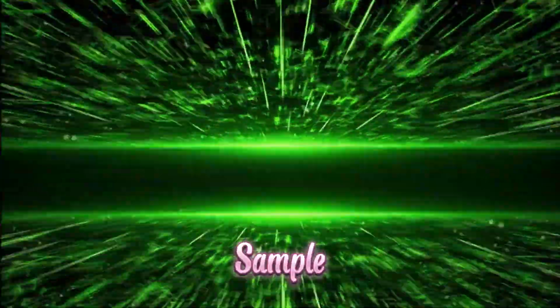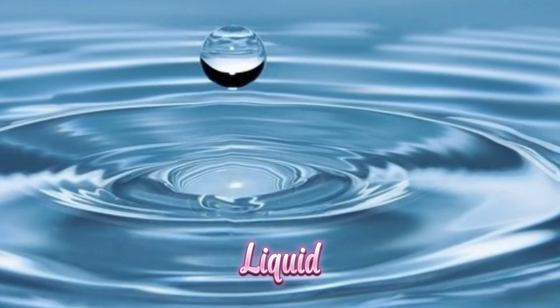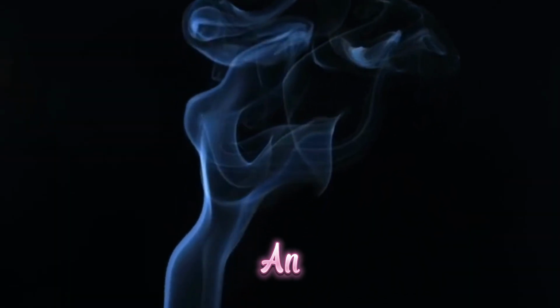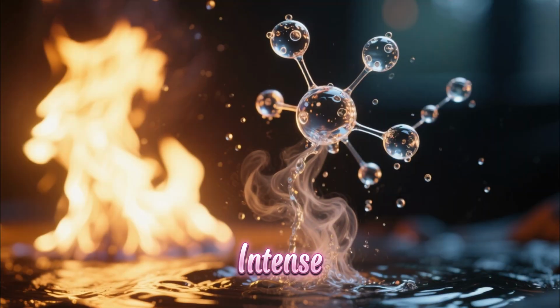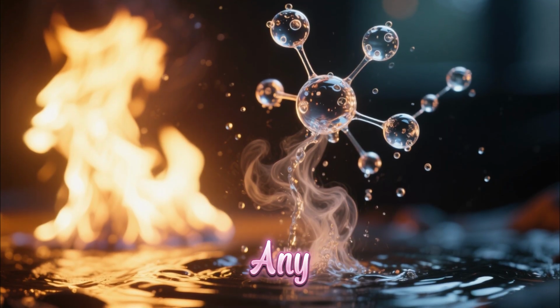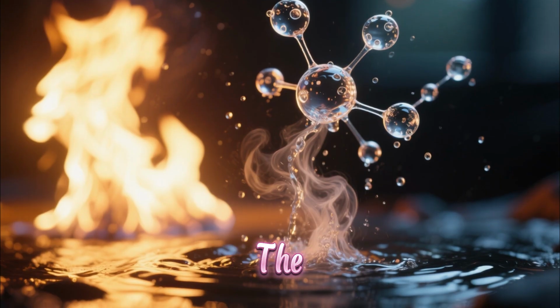Imagine you have a sample, let's say a drop of water you want to test. First, this liquid sample is turned into a fine mist, like a perfume spray. This mist is then mixed with fuel and an oxidant, and fed right into a flame. This flame is super hot, we're talking thousands of degrees Celsius. This intense heat does something amazing. It evaporates the water and breaks down any compounds, leaving behind free, individual atoms floating around in the flame.